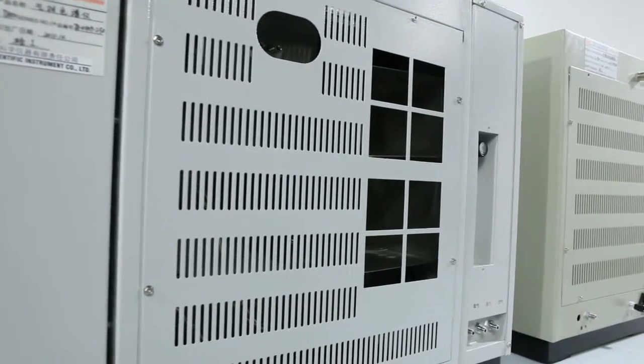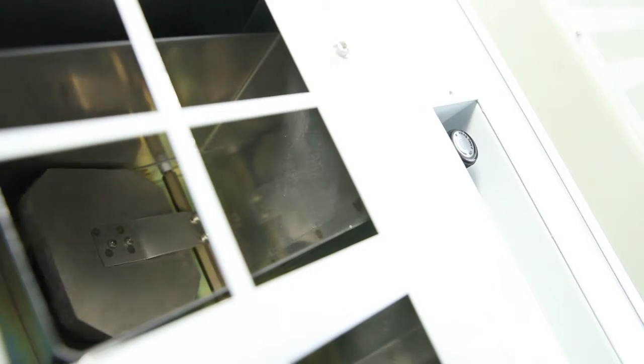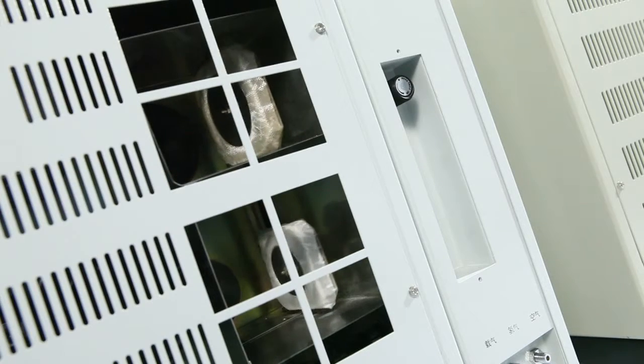The large volume oven utilizes an auto-control back door, which can achieve a 250 degrees centigrade temperature reduction in only 15 minutes.